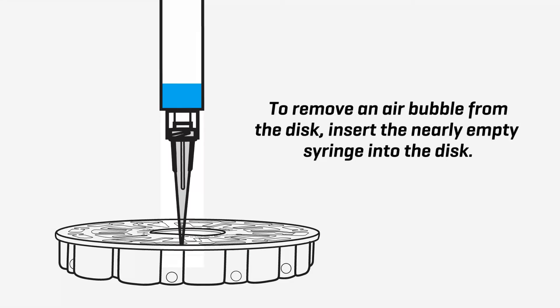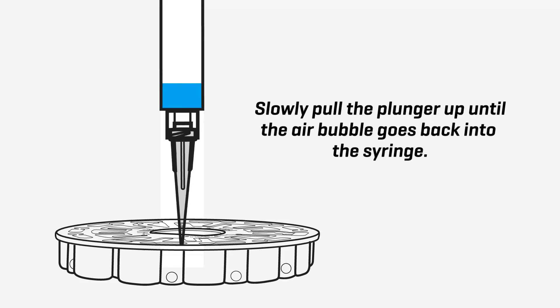To remove an air bubble from the disc, insert the nearly empty syringe into the disc. Slowly pull the plunger up until the air bubble goes back into the syringe.